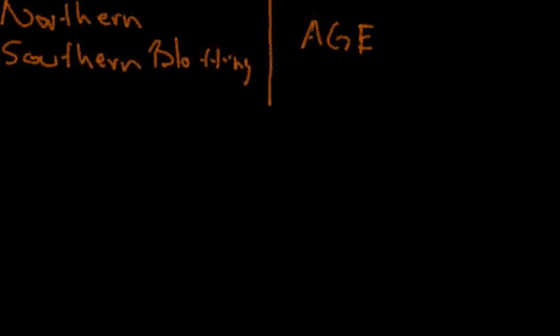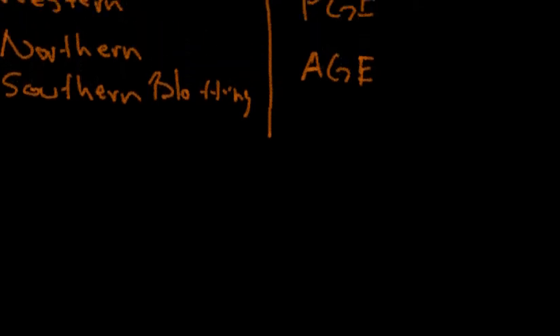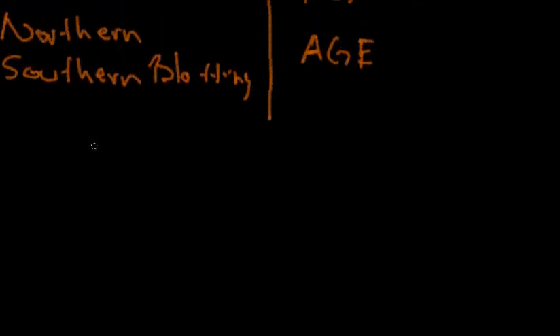So we want to use an example of a gene and gene product. We can use any gene or gene product, and this can be used, and it doesn't even need to be human genome. It can be viral genome too. So you can be looking at the expression of, I don't know, P48 in HIV, or the expression of H1 in influenza, a certain influenza strain. But for the sake of making it really simple, we're going to look at keratin, hair.